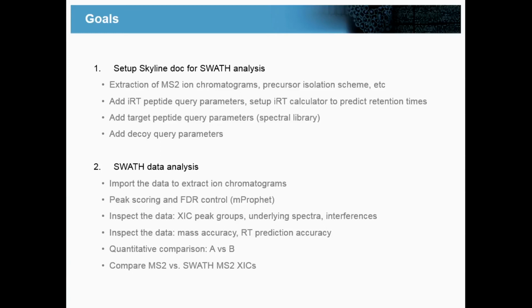And then the next thing you need to do is go to the DIA data and import it. And this is the time at which you can nip out for a coffee for 20 minutes. And then we're going to look at the peak scoring and FDR control as was described by Ludovic this morning and Isabel in these talks this morning. I encourage you to look.